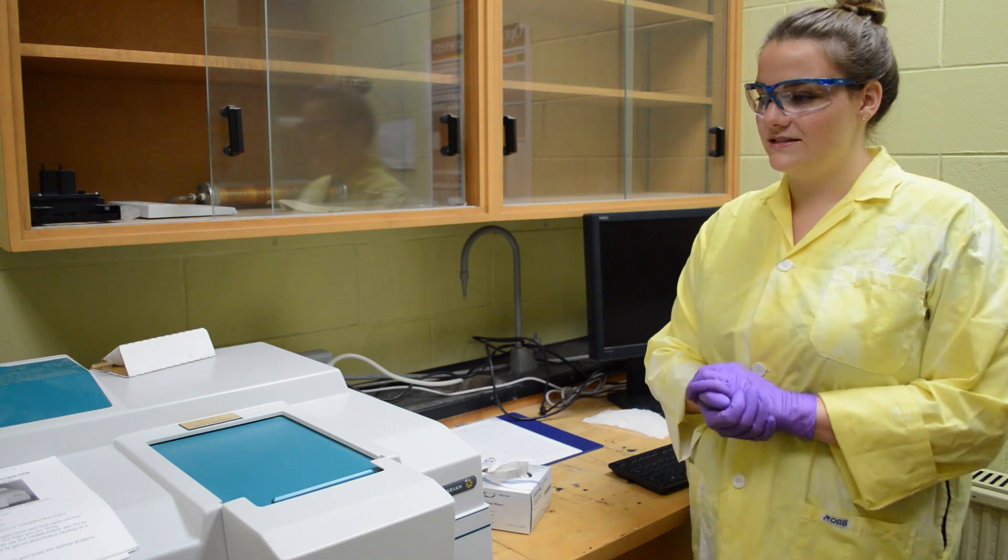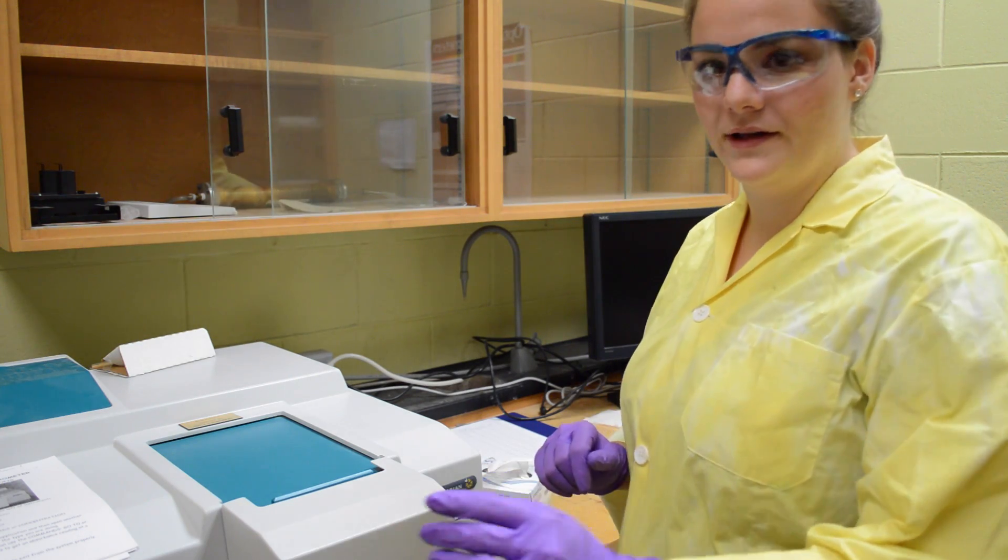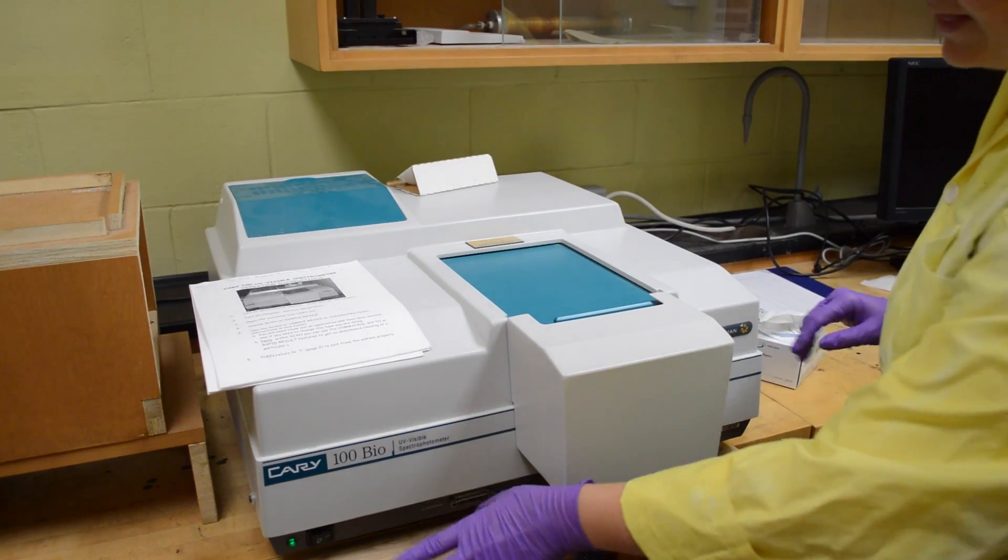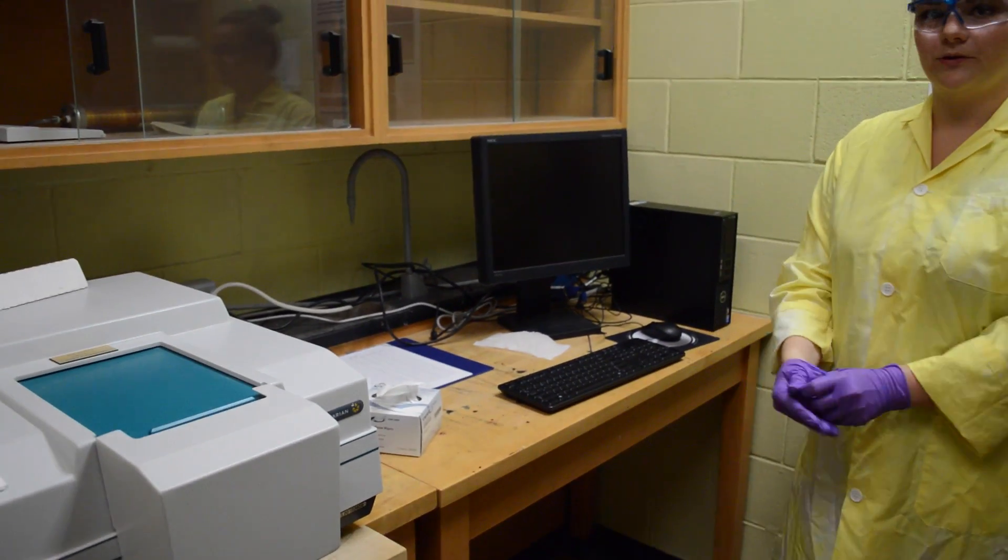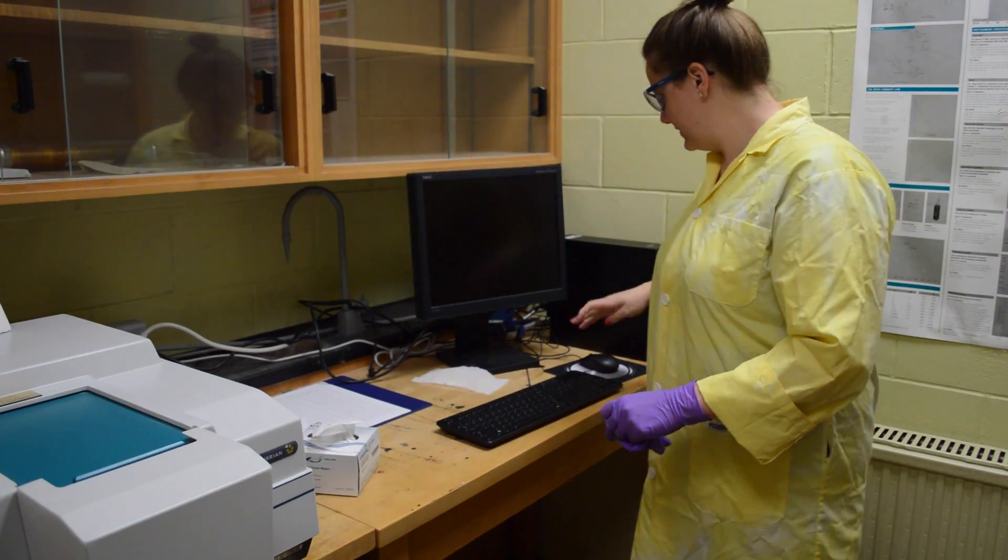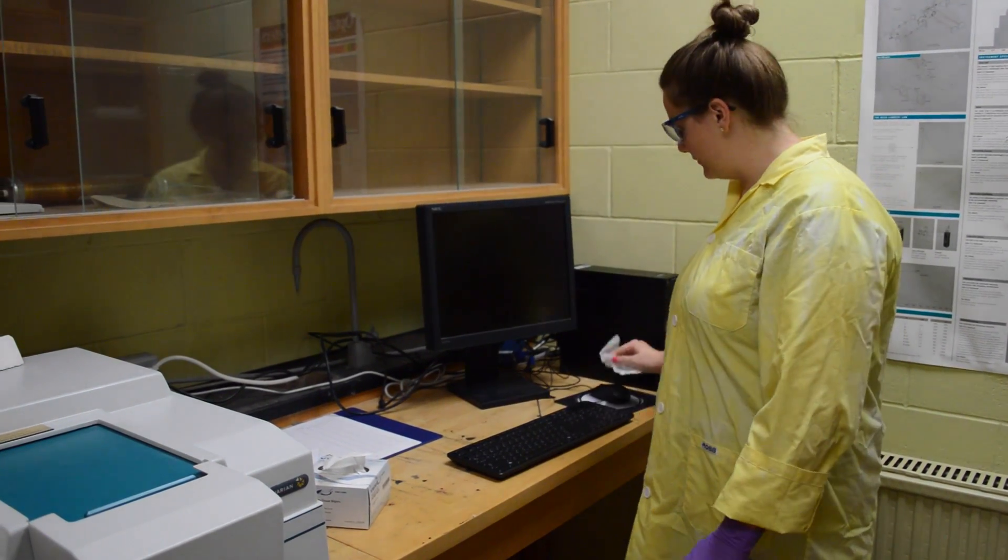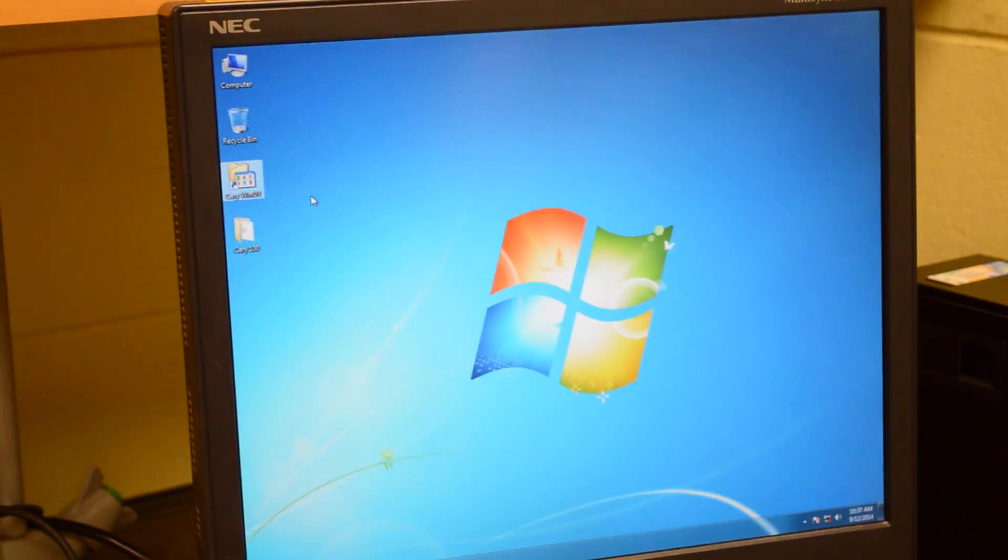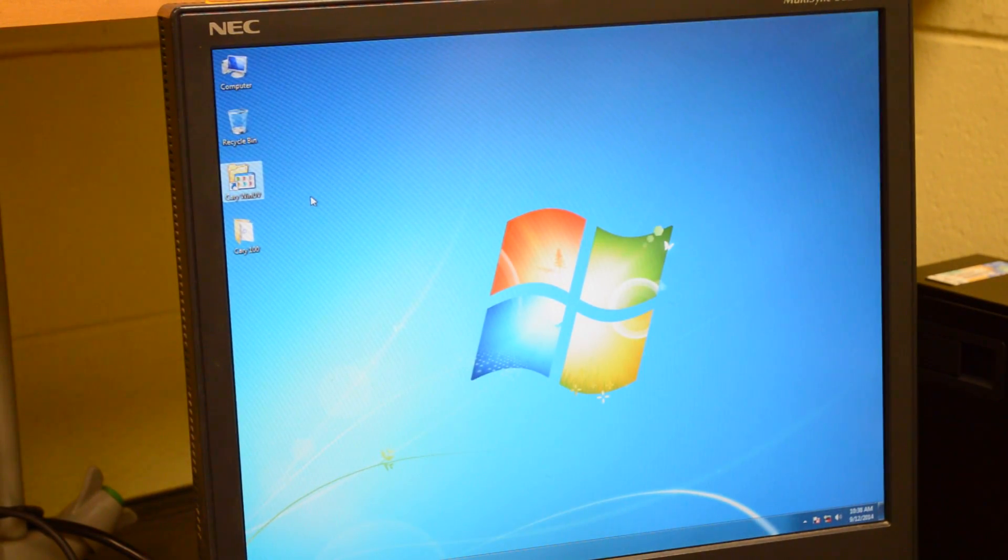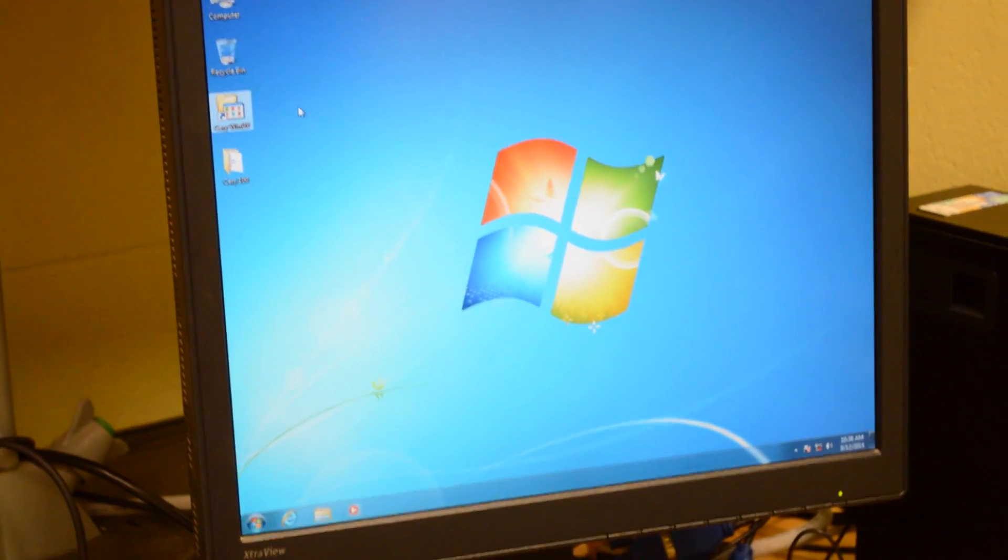To set this up, you just turn on this button here and that should be fine as long as it is warmed up. To set up the computer program, we are going to remove your glove so no chemicals get on the mouse here. This computer is always left on, so you just have to turn on the monitor and open the software icon.